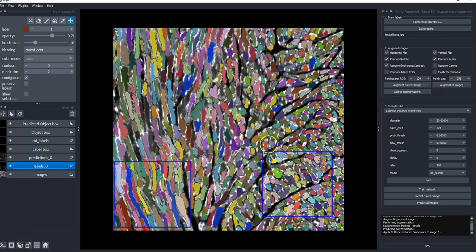So again, this example's main purpose is to see if the Cellpose model will handle objects of different shapes, but it's not a reflection of how good you could do if you really carefully did your labeling.